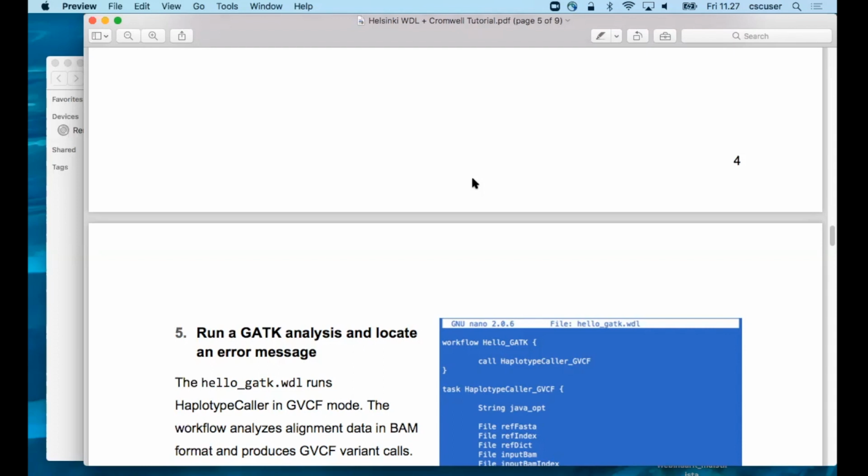Actually, I think it's in solutions. Build solutions, turbo, that WDL, solved. Yeah, this one has the errors. I mean, it's a small one, but something with more than one call.